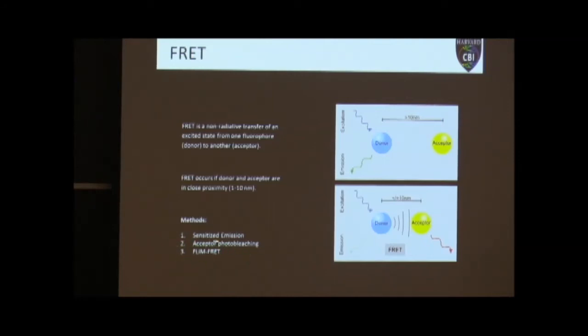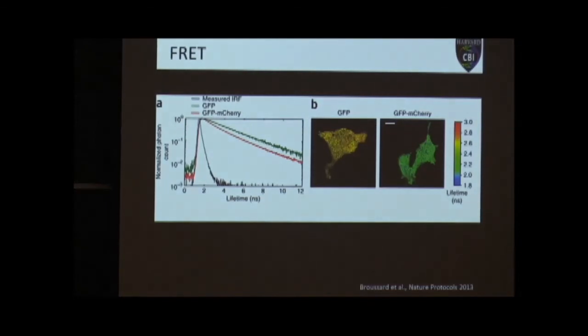But now what we have is this option of FLIM FRET. And in my personal opinion, this is the best way to do FRET because it takes out a lot of the general issues or problems with FRET. I'll get to that in a second. So what are we doing with FLIM FRET? Here's an image of an experiment.